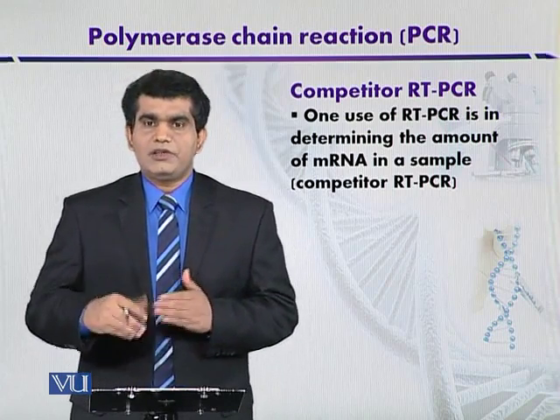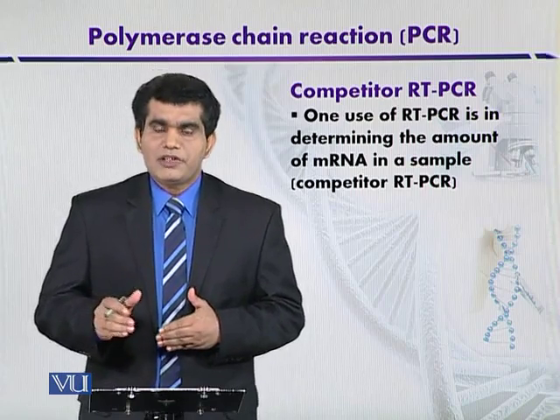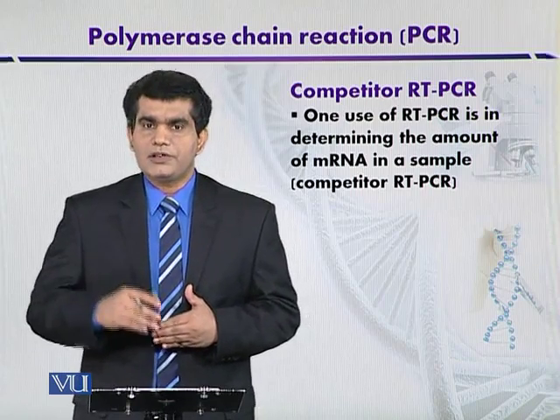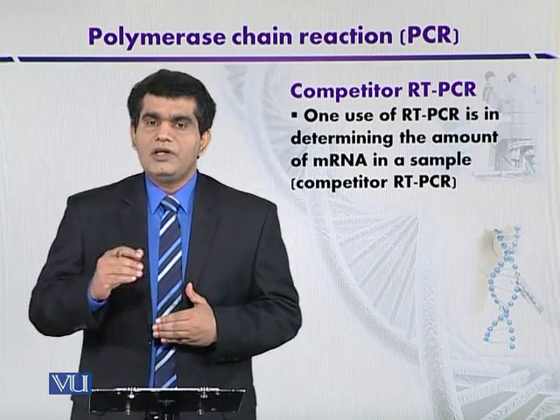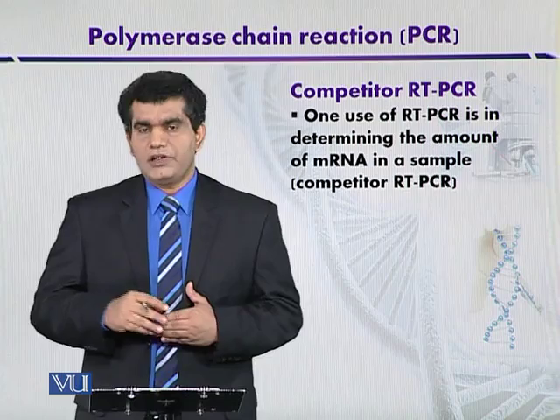That is, they may be present naturally in the tissue, or they may be the result of contamination from the laboratory environment. In either case, it can inhibit or it can degrade the RNA molecule.